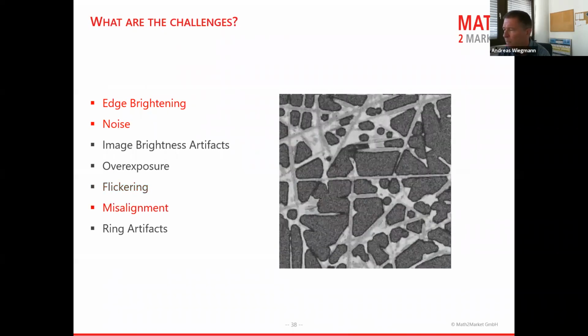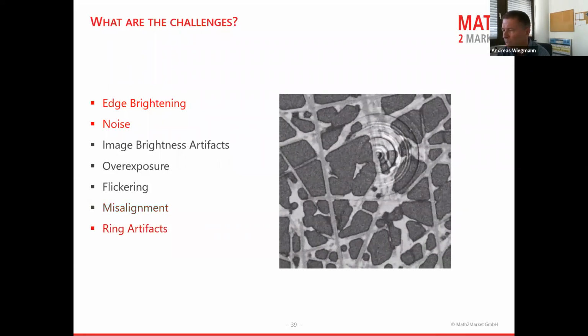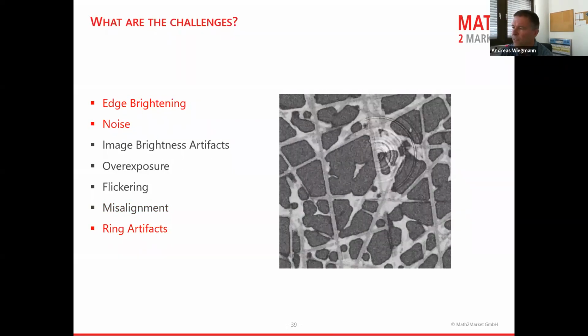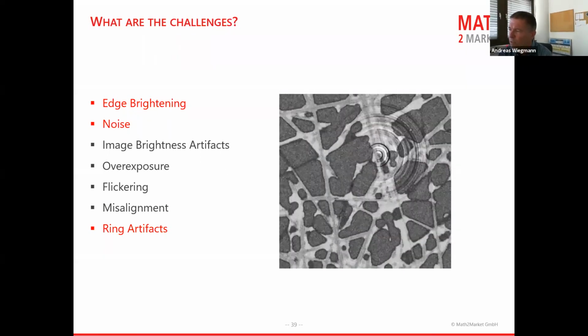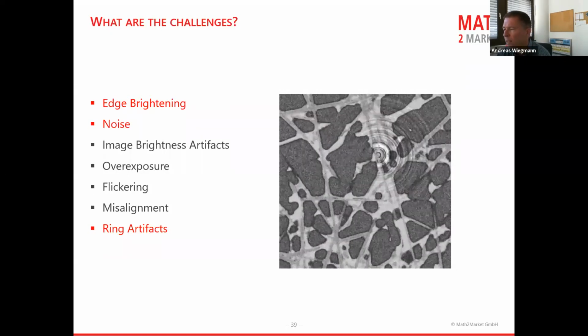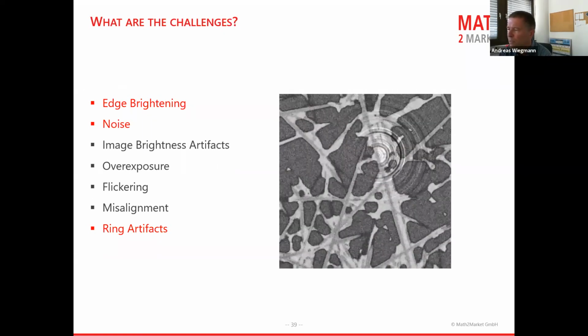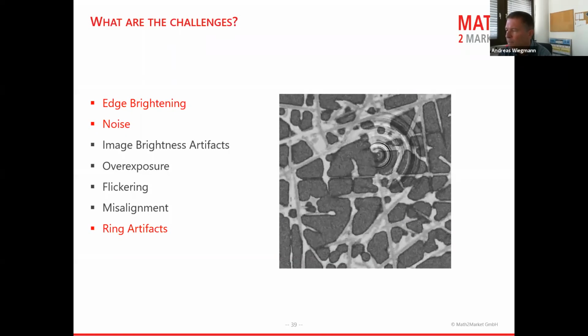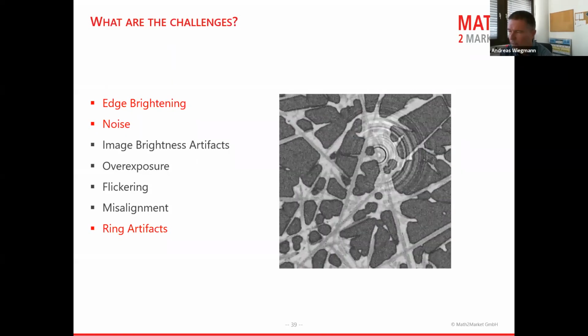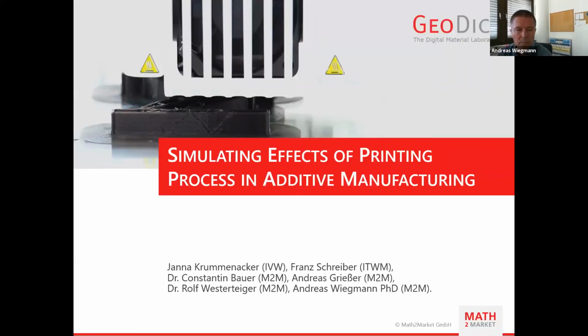You have misalignment in FIB-SEMs in particular, where the individual frames jump around, or you may need to remove ring artifacts and so on. And so your AI should be trained on images with all these artifacts on them to then recover what we had started out with in this process. In our case, the model, but if a real image goes in there, the real objects that were segmented, here, two kinds of binder and fibers, let's say. So this is one of the topics that we provide for other people to work with as well.